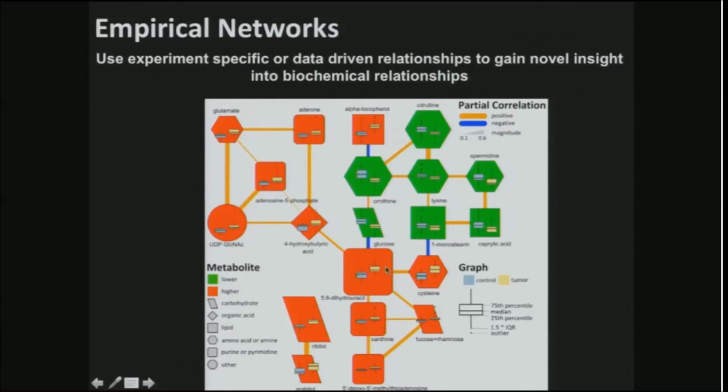So our most important molecule is, well, in the center. And this wasn't organized by me. This is just data-driven. So it's big. It was a big change. It was important on a multivariate level. And it also has the most connections. So it's kind of drawing our eyes there.